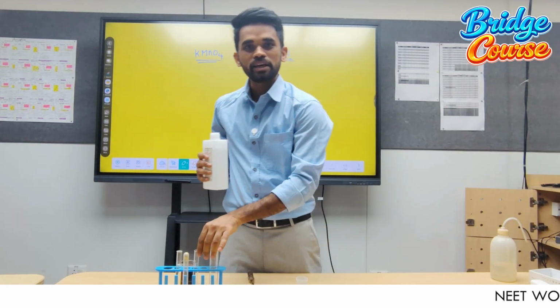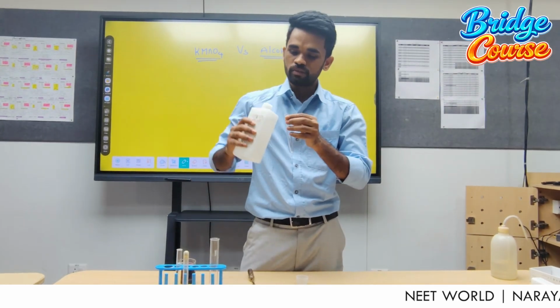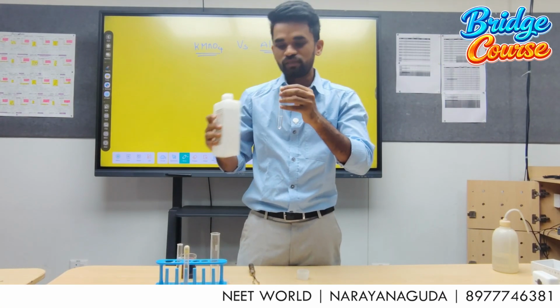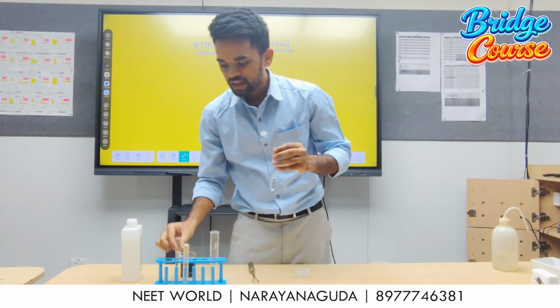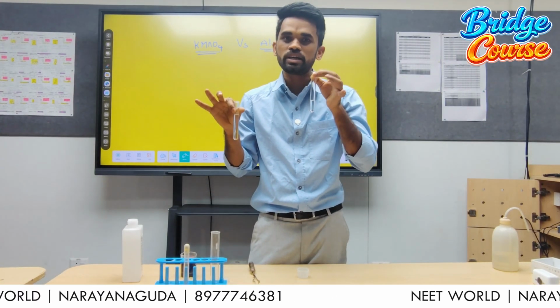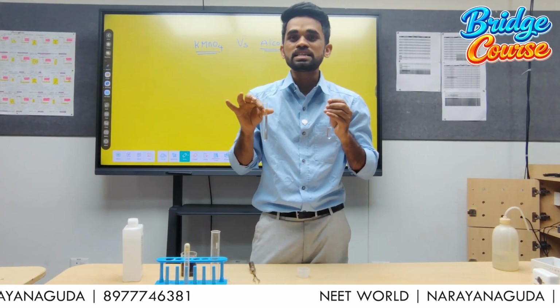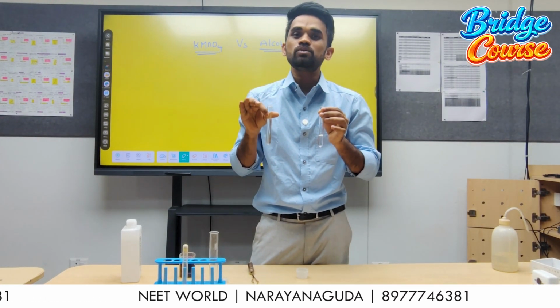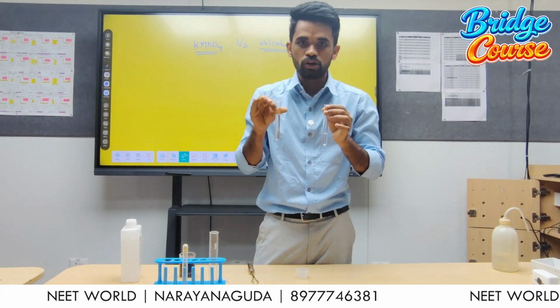So here I am taking ethyl alcohol in this test tube. Let us see what will be the scenario here. See, in one test tube I have taken water, in the other test tube I have taken ethyl alcohol. Now let us add KMnO₄ to both of these test tubes and let us see what will be the magic we are going to observe.